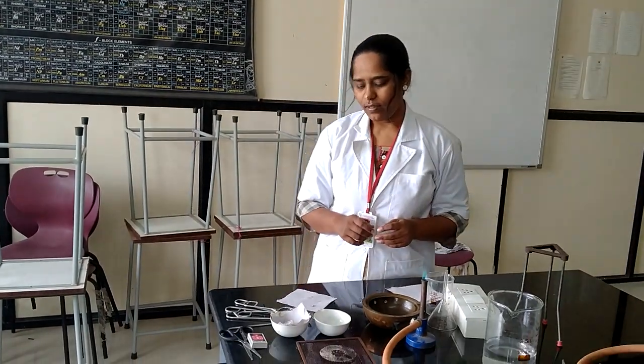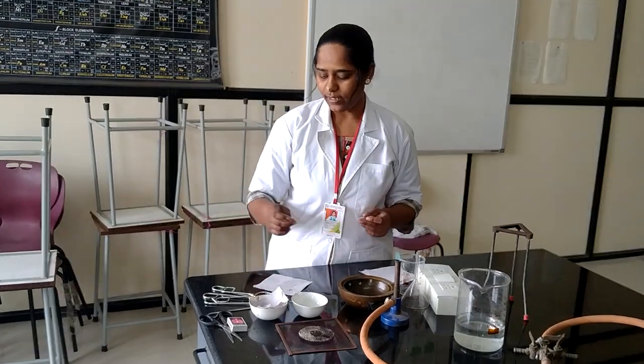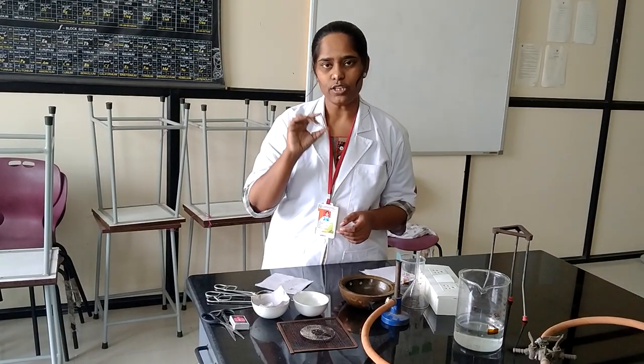Good morning to all. Today we are preparing sodium metal extract solution. For this practical we need some apparatus. First one is the fusion tube.